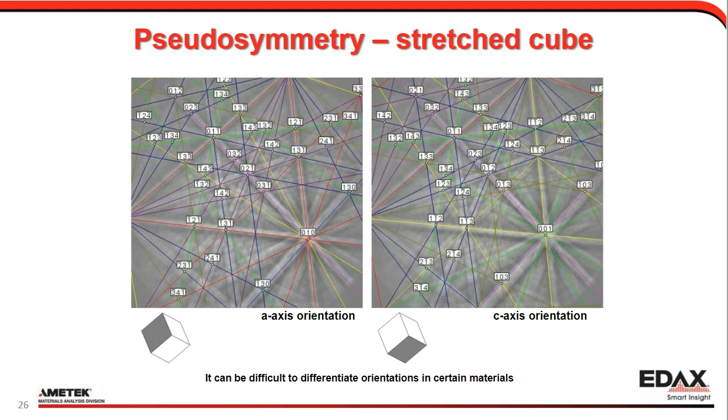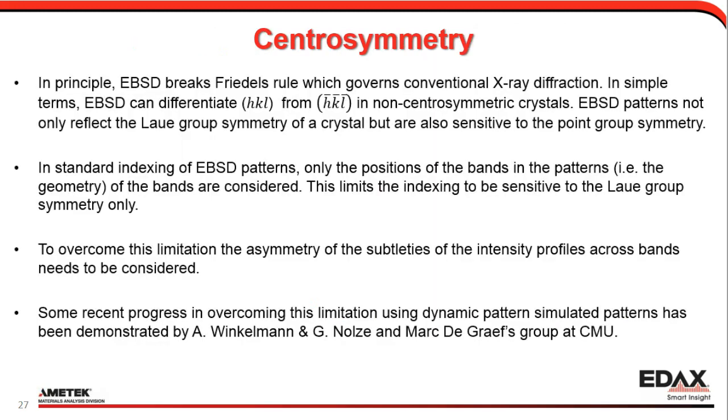So that's another example. But there's also the example of centrosymmetry, and this is something we do tend to ignore quite a bit in EBSD, but it is there. So in principle, EBSD breaks Friedel's rule, which governs X-ray diffraction.